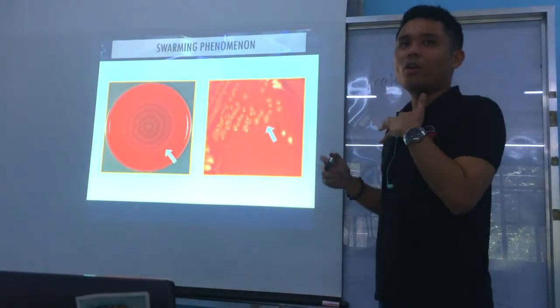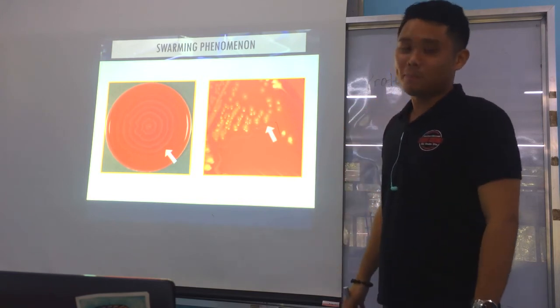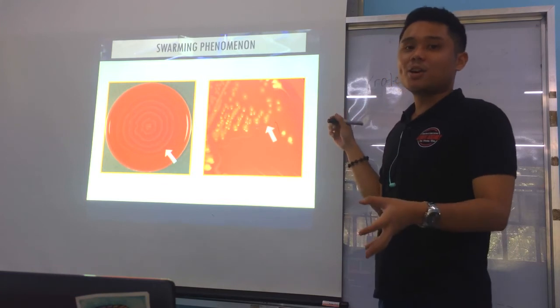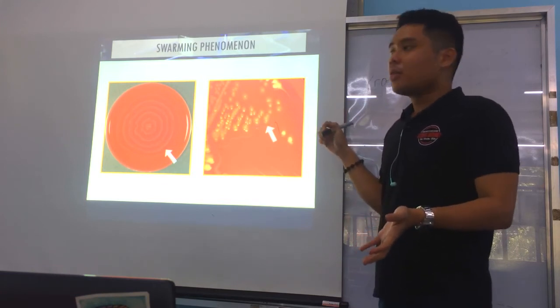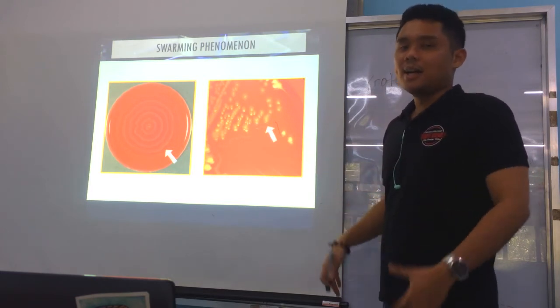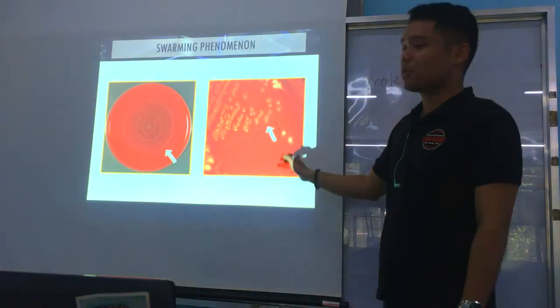Ayan. Basta guys, ganyan, muingon ka na, what do you call this? Case studies. The organism exhibits swarming phenomenon, gram-negative bacilli, press the buzzer. It could be proteus yun. Alright, and proteus species usually makakause siya UTI or mga urinary tract infections. Now, through the help of their swarming or hypermotil sila, muna makapropel sila from the bladder to the urethra, from the urethra to the bladder, and because again, it's hypermotil.